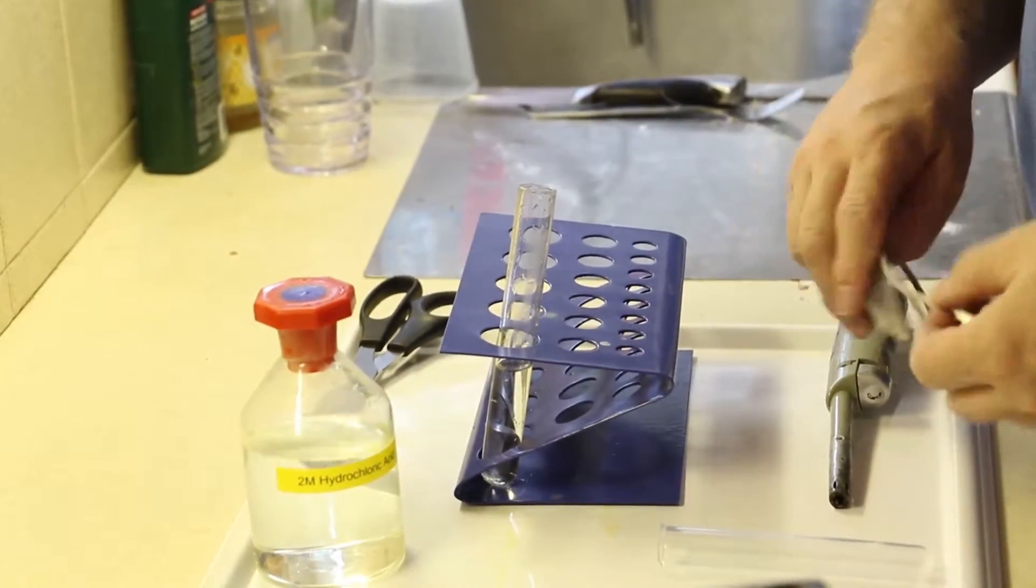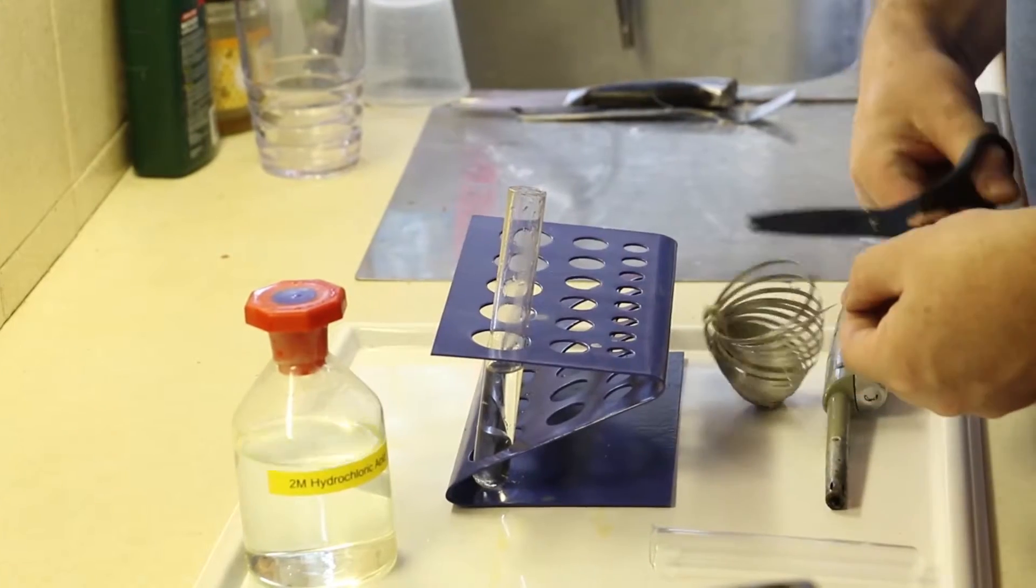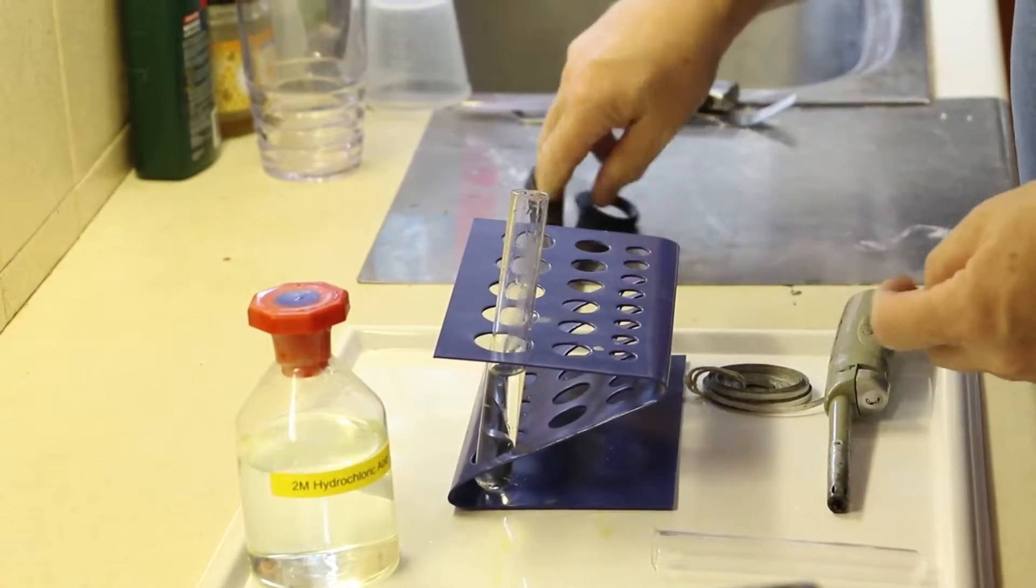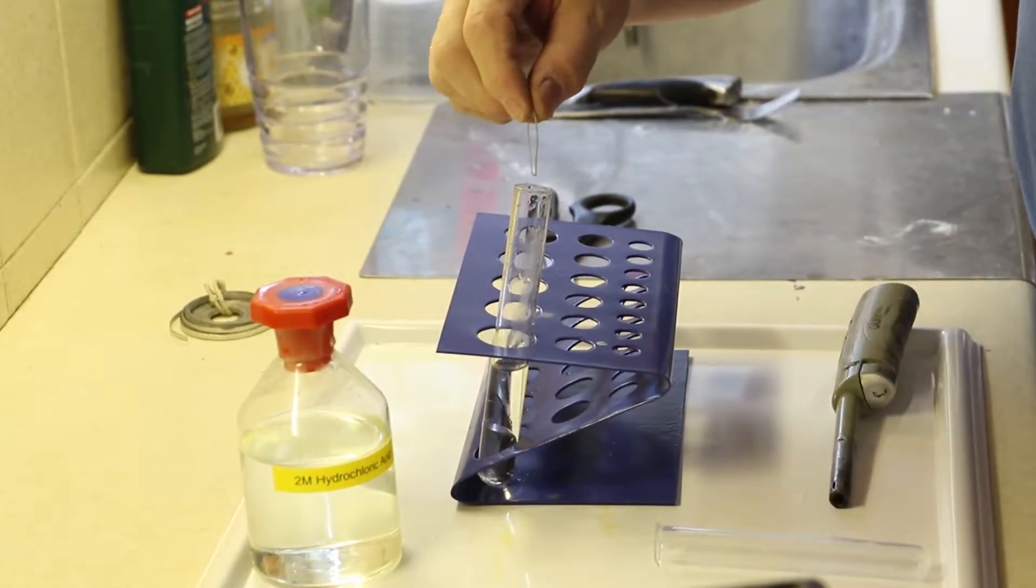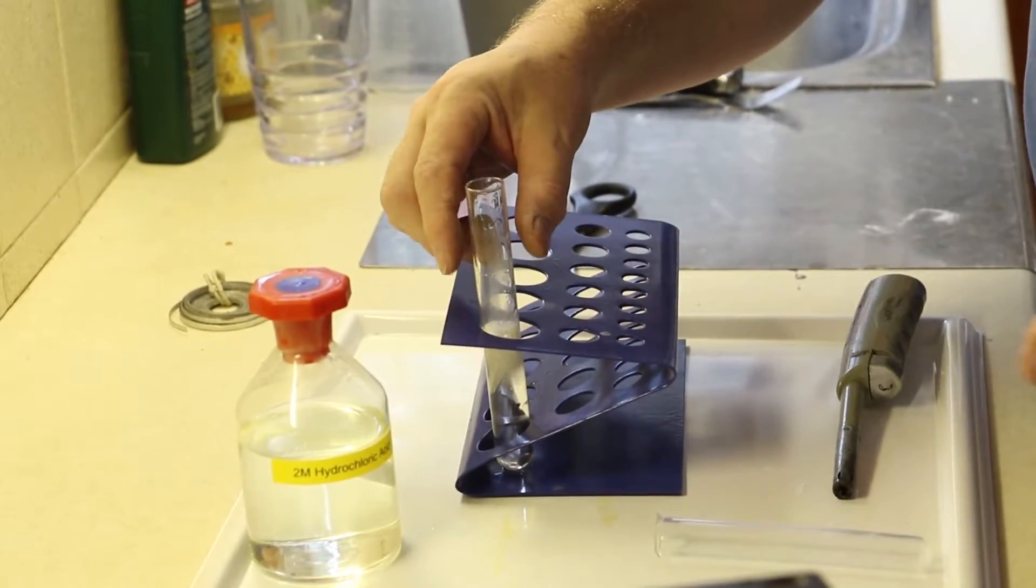We're then going to take a small amount of magnesium ribbon, fold it in half, and put that in there.